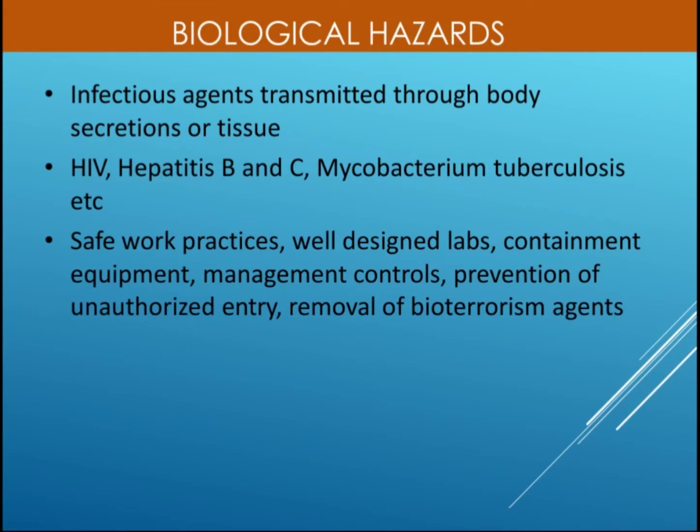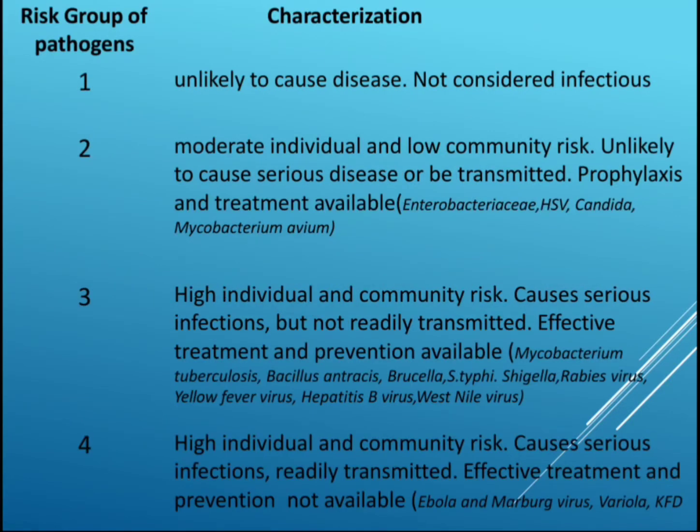So, safe work practices, well designed laboratories, containment equipment, management controls, prevention of unauthorized entry, and removal of bioterrorism agents are all the biological hazard safety measures which are to be implemented in the laboratories or on the campus.